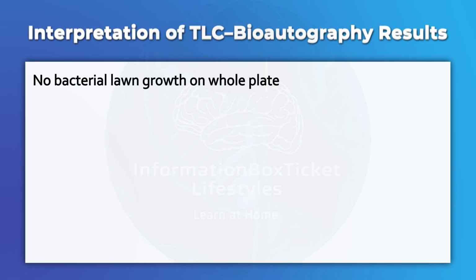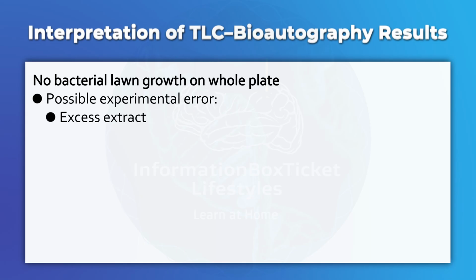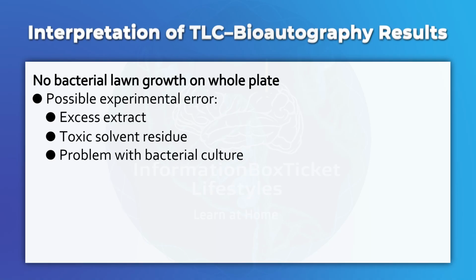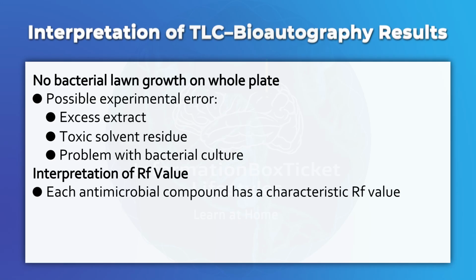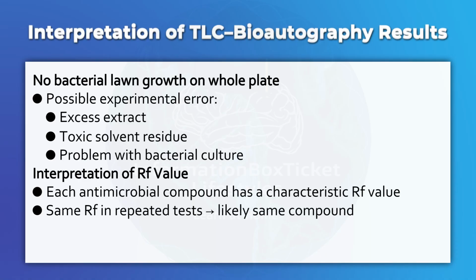No bacterial lawn growth on whole plate: possible experimental error, excess extract, toxic solvent residue, or problem with bacterial culture. Interpretation of RF value. Each antimicrobial compound has a characteristic RF value. Same RF in repeated tests implies likely same compound.